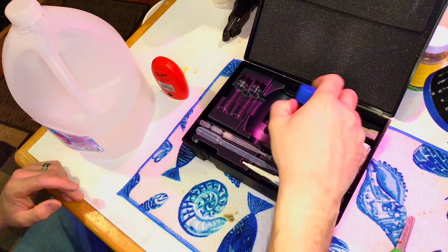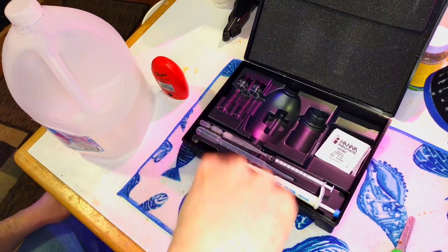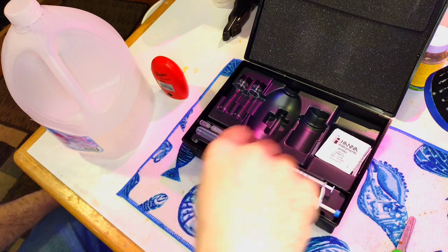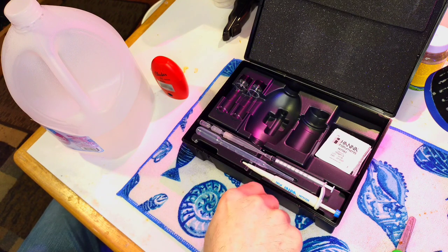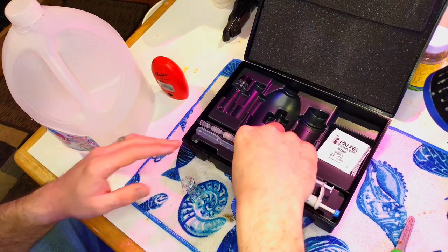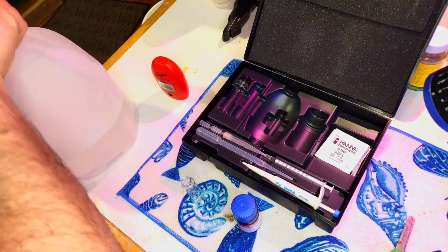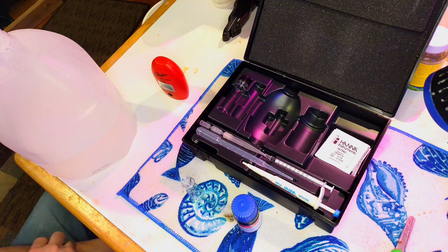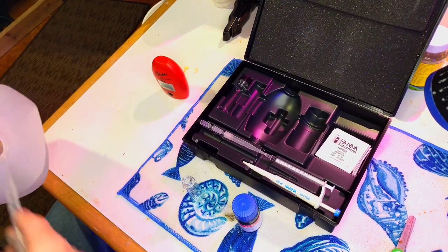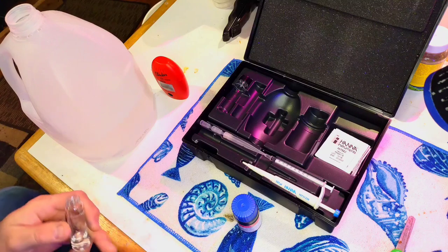The first step is to put in one milliliter of Reagent A. Same as with the alkalinity reagent, I like to swirl it — this is a test I don't use as often, so swirling it up is important. In this particular tester you want to use distilled water instead of RO water. The instructions may even call that out. That's where some people have trouble — RO water can have impurities that affect the reading. First, rinse out the vial with some distilled water to remove any residue from last time.